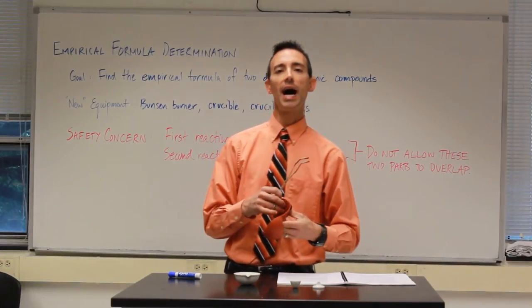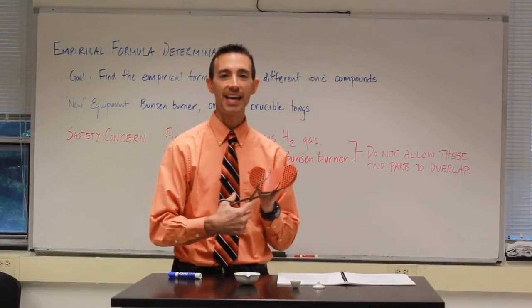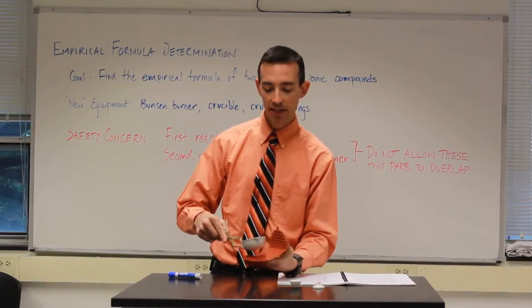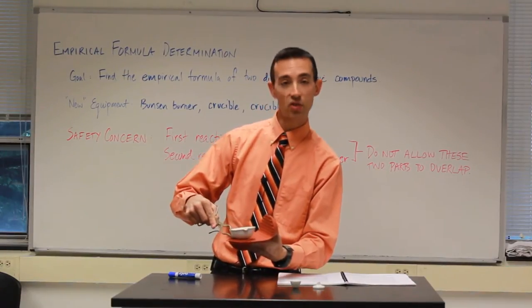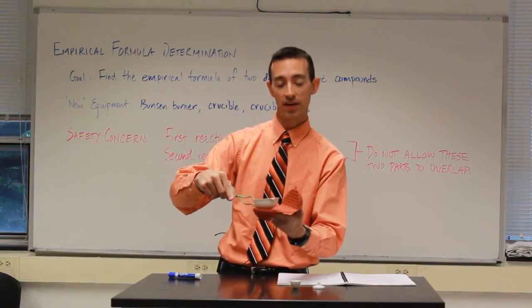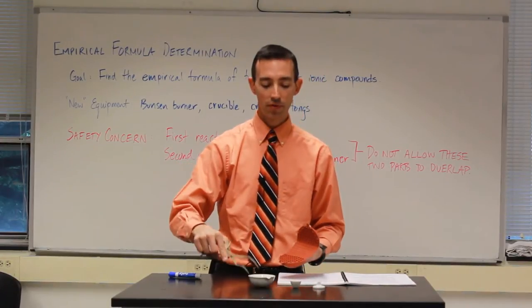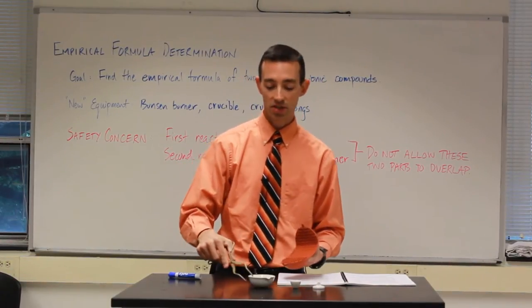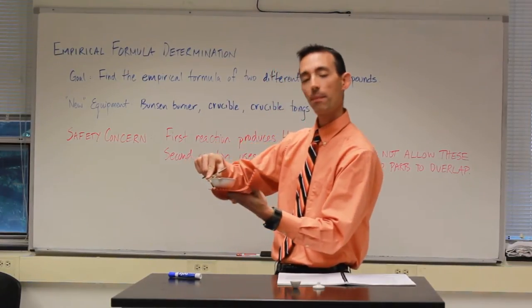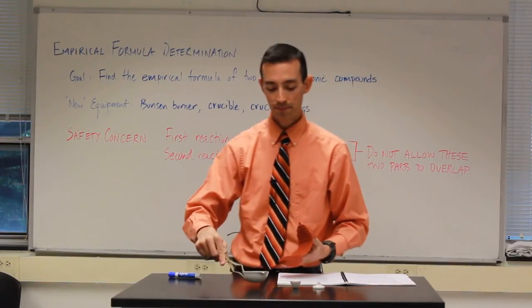Now, both of these will be hot when you need to handle them, and so it might be a good idea to have a hot hands. Just a simple rubber piece that would insulate your hand underneath. And it can even rest on this. That's the very purpose of the hot hands, is to protect your hand. So you can walk from the oven where we store both the crucibles and the evaporating dishes to your workbench area like this, holding the evaporating dish or the crucible on top of your hot hands.